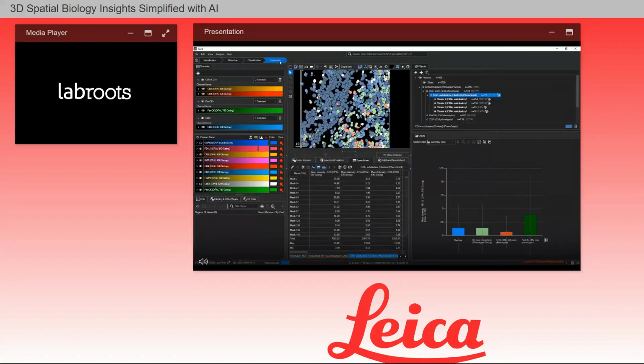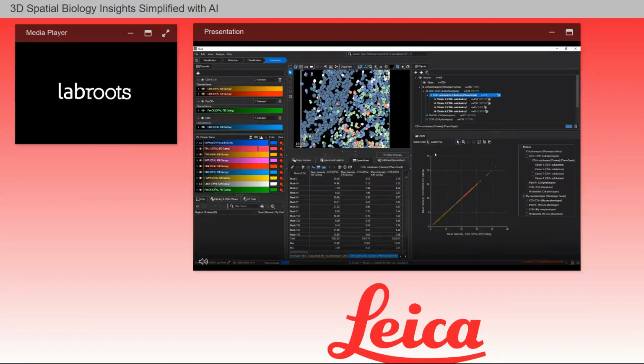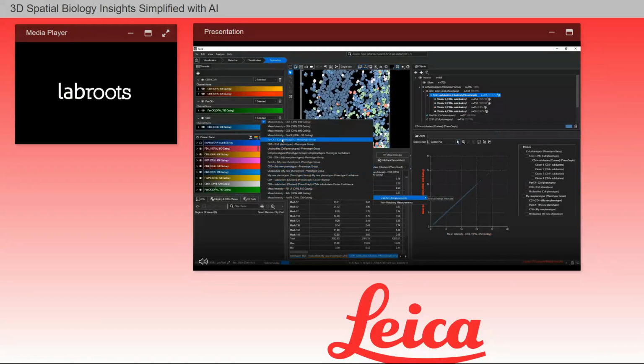Click on the exploration chevron. Now the layout of Aivia is updated again. Let's go to the Charts tab and look at some data exploration options. I am going to select Scatterplot from the drop-down menu, and I'm going to turn off all my other object sets. I can click on the axis label to select the measurement I would like to plot. I am going to plot mean intensity of the CD3 channel against the mean intensity of the pan-CK channel.